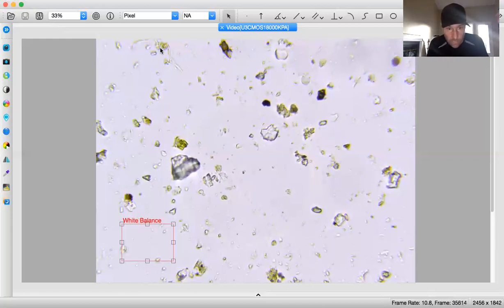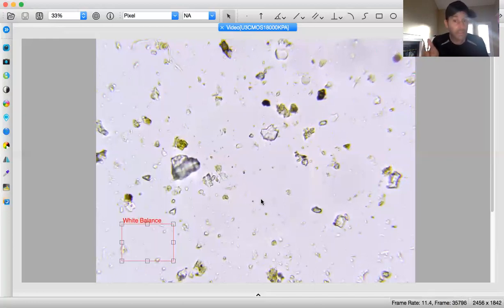Alrighty. Don't see anything else to record. That is possibly a cercozoa. But my mentor has indicated through email that he doesn't know what a cercozoa actually looks like, or a small flagellate in relation to a ciliate cyst. I said it couldn't possibly be a ciliate because of the size, so it has to be either a cercozoa or a flagellate.